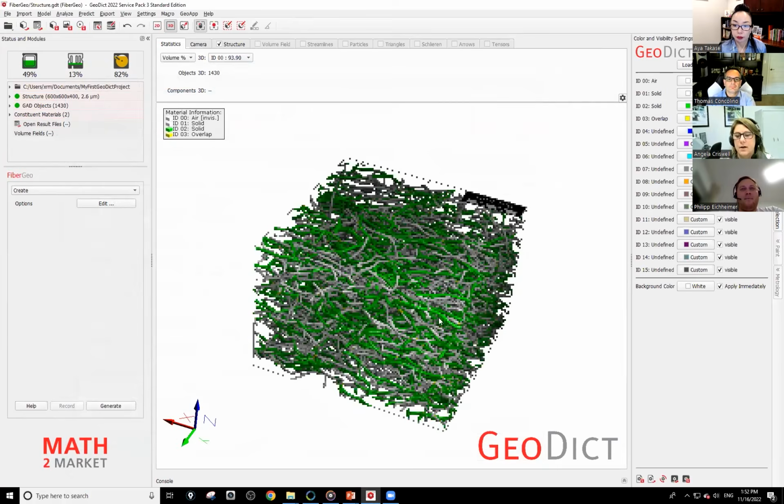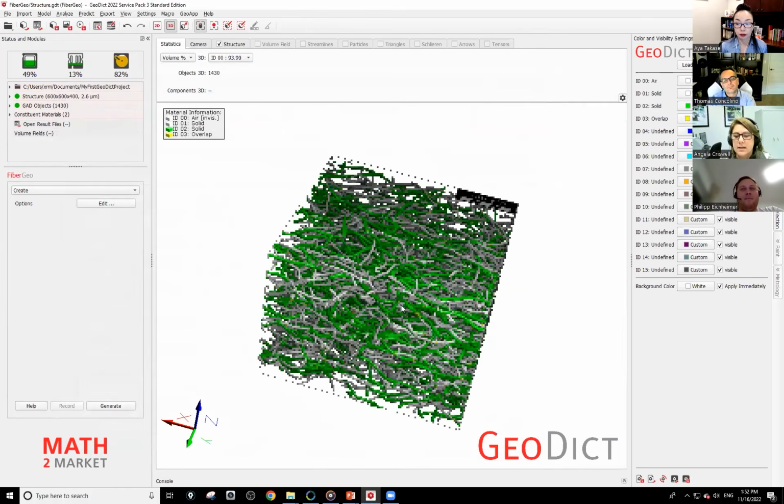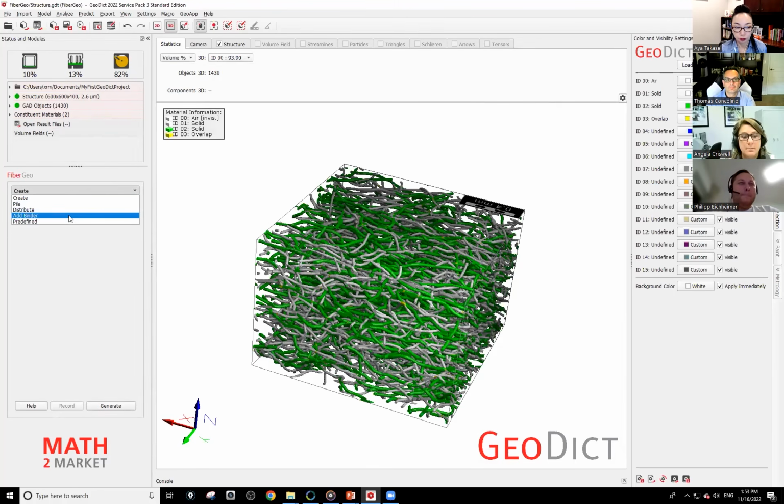Now we're getting somewhere. So you can see that some minor tweaks could get you in the general direction that you want to go. Then you want to run the filtration and see if you have the pressure drop that you expect and the other characteristics, and then create all of your digital twins to do your stepwise analysis of the models. Before you do that, you might also want to add binder.